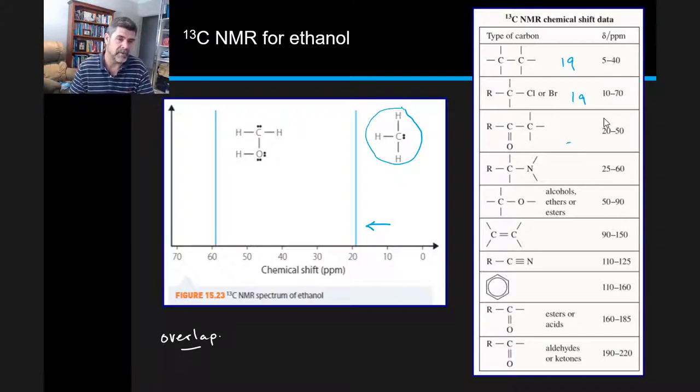or confirm the presence of one or more halogens. So this is one of the little problems that we have when we're trying to read the spectra for NMR is that sometimes these peaks are occurring at places where there can be more than one solution.